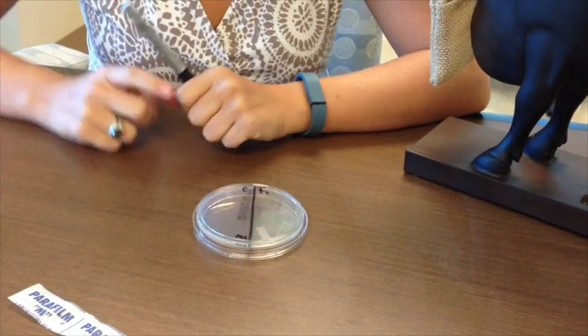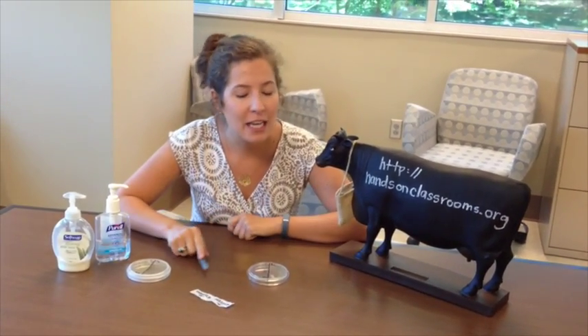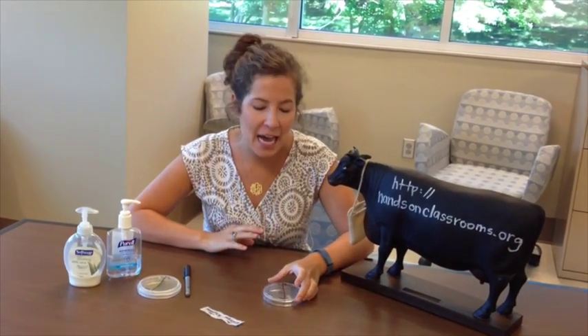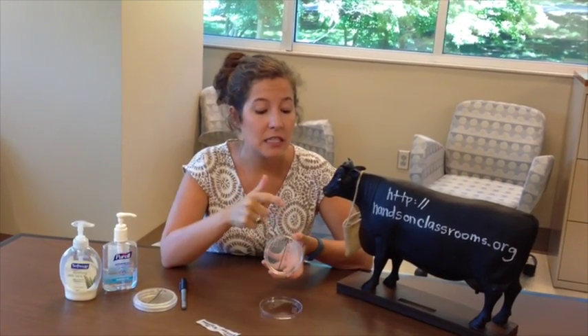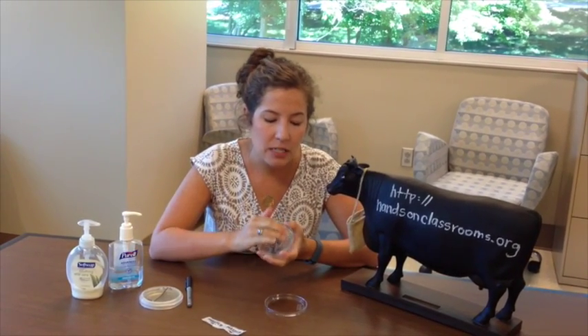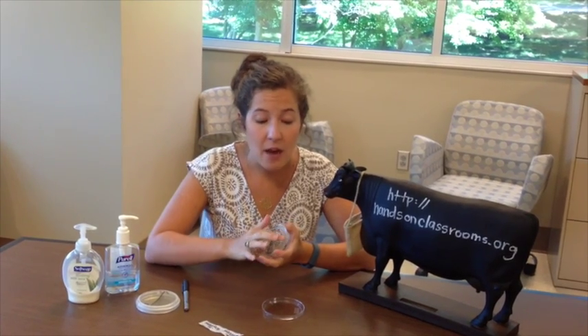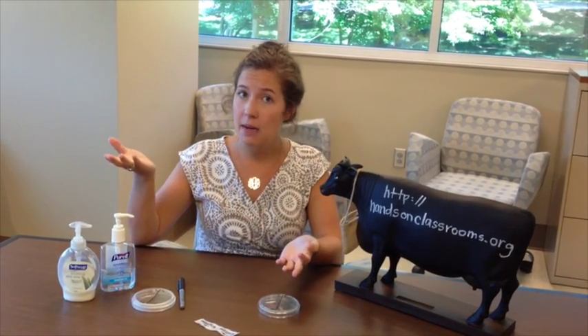After you've labeled your plate, you're now going to shake hands with three to five of your classmates and then we'll begin the experiment. After you shake your friends' hands, take your fingers as if you're getting fingerprinted, and touch your fingerprints to the C side — the control side — because these are our dirty hands. You can rub it all around, but make sure you don't actually puncture the agar, so be very gentle. Then put the plate back down so we don't contaminate it.